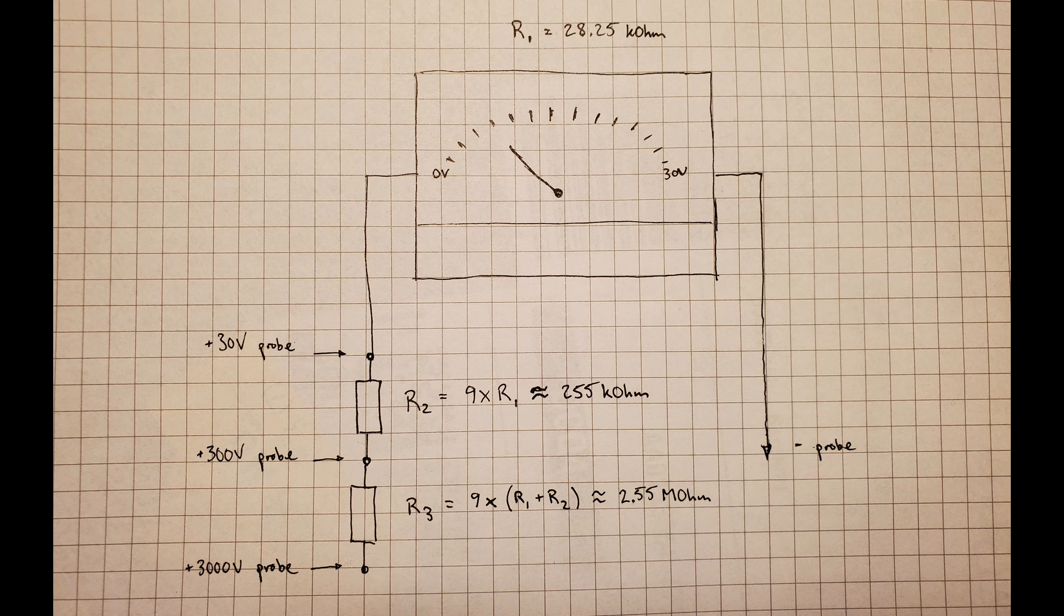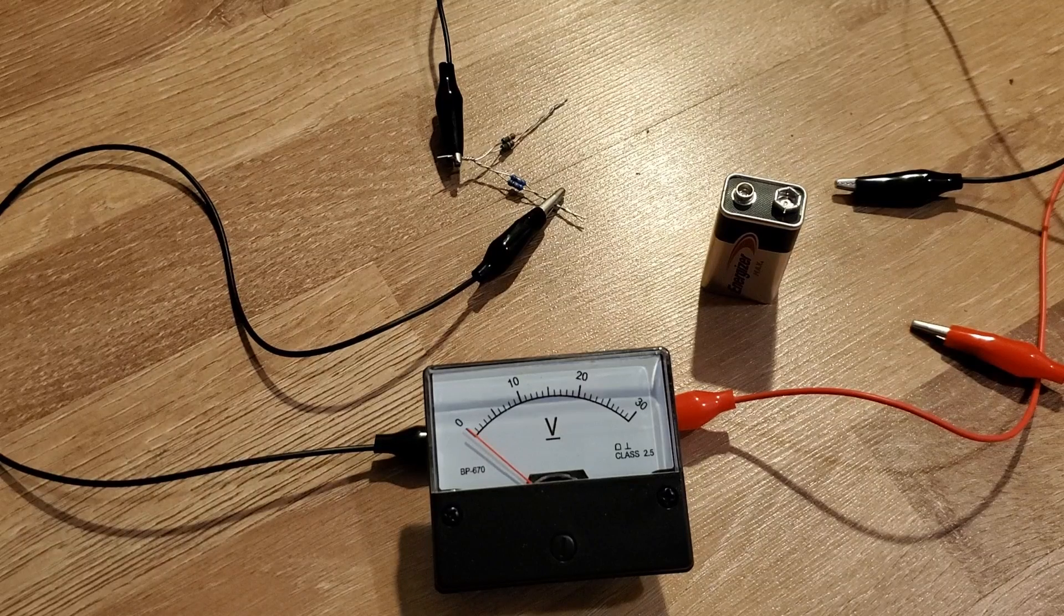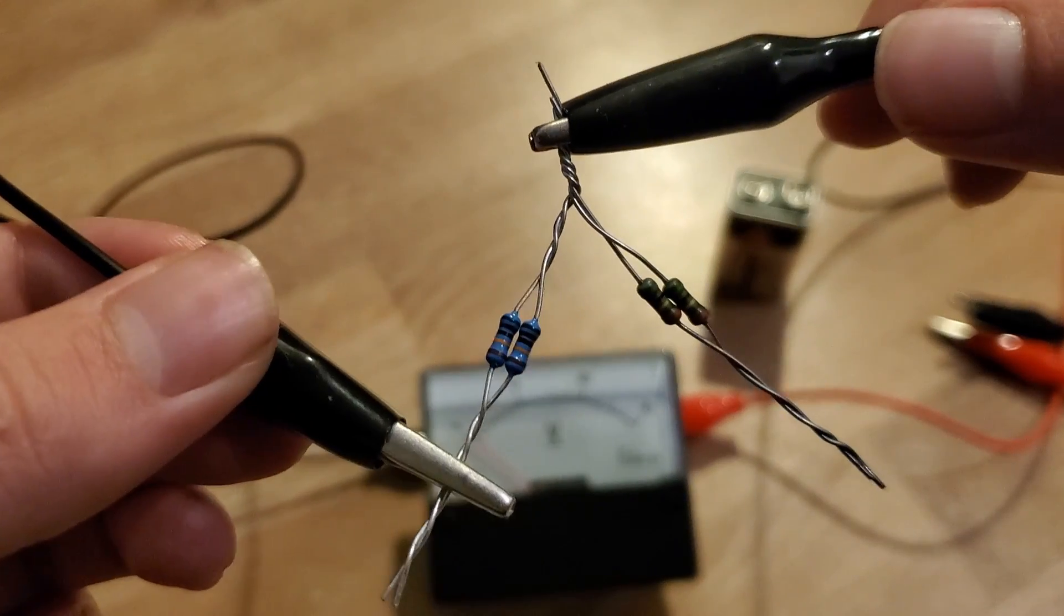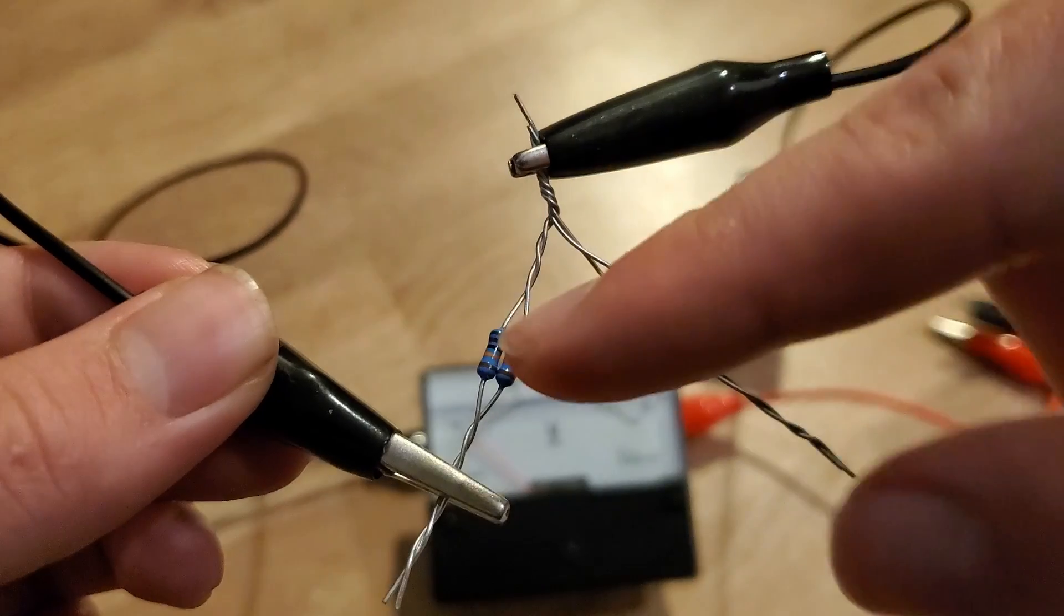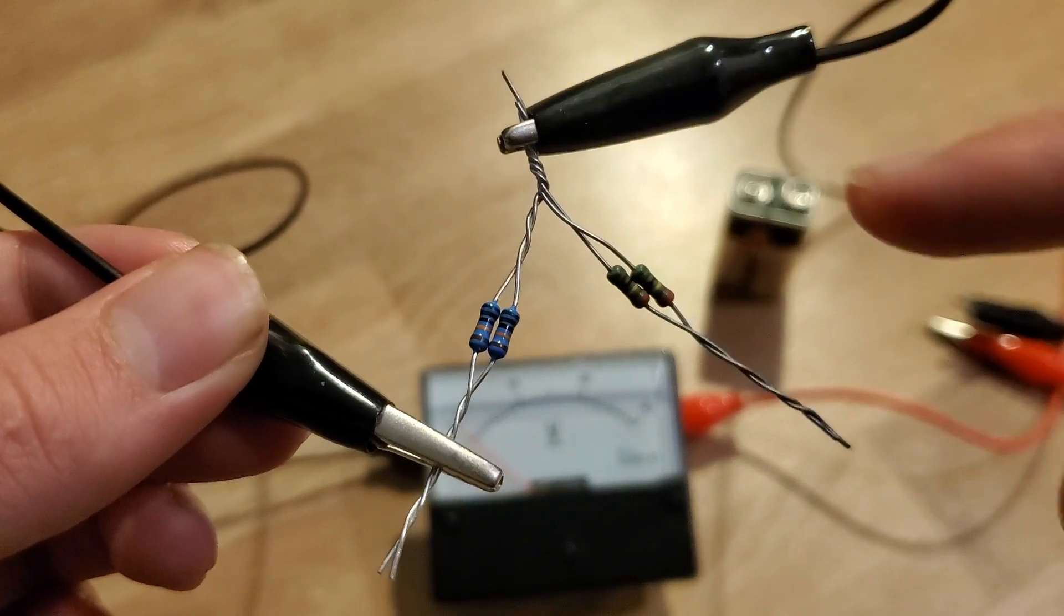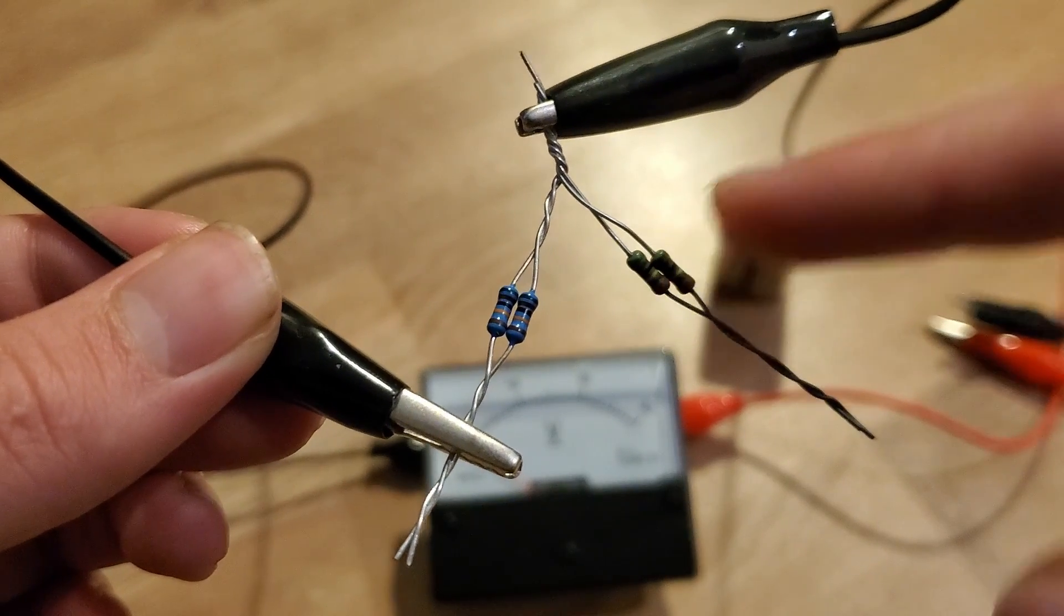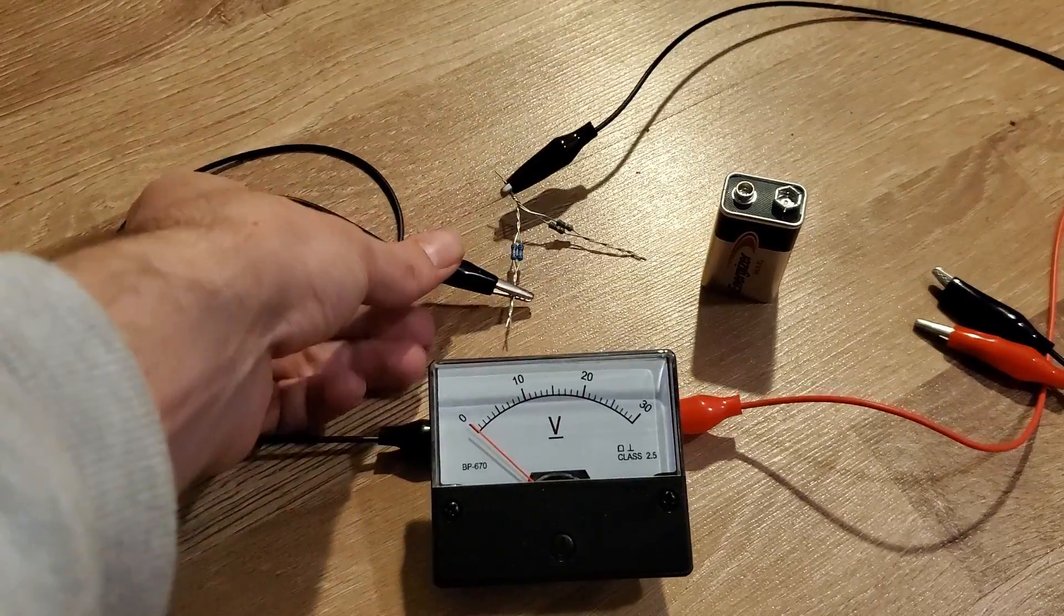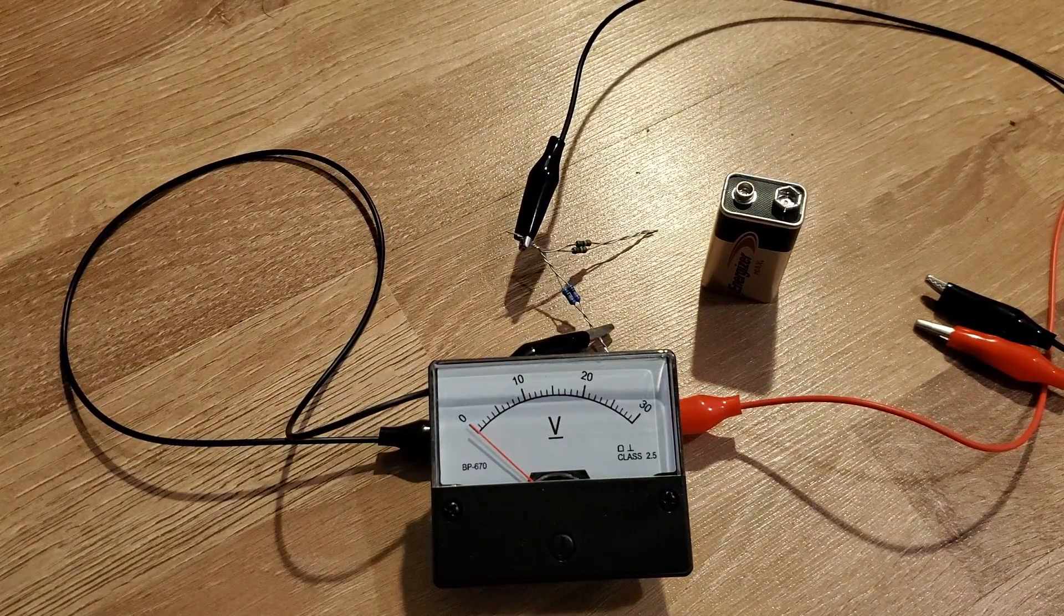The 300 volt range is useful for running gels, while the 3000 volt range is useful for electroporation experiments. Since I couldn't easily source any 255 kOhm or 2.55 megaohm resistors online, I simply put two 510 kOhm resistors in parallel to get 255 kOhms or two 5.1 megaohm resistors in parallel for 2.55 megaohms. The result isn't very pretty, but it works.